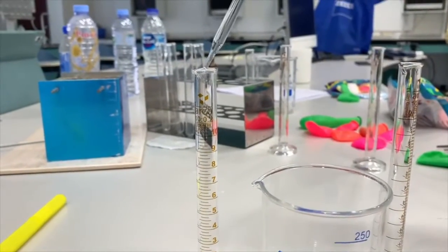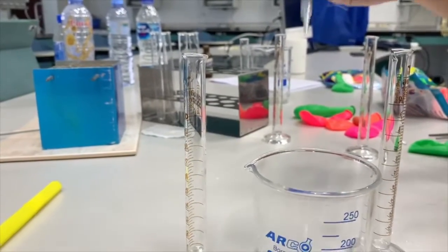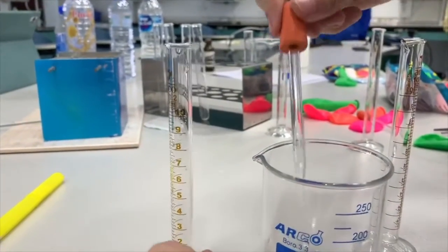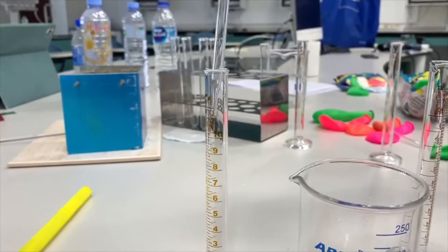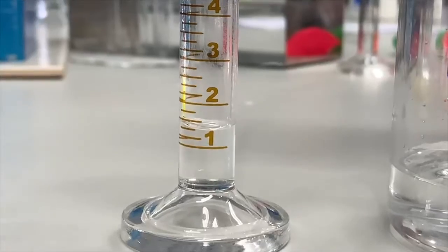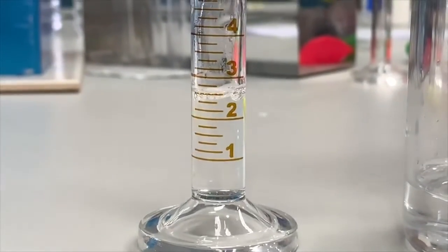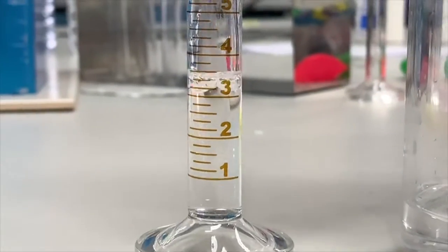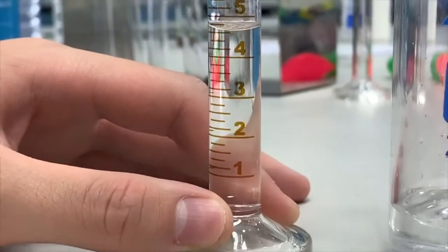Fourth, prepare yeast solution into the test tubes by 0, 3, 6, and 10 milliliters respectively, and also add glucose solution by 5 milliliters to our test tubes. Fifth, immediately cover our test tubes with balloons and leave overnight. Sixth, check on the result.